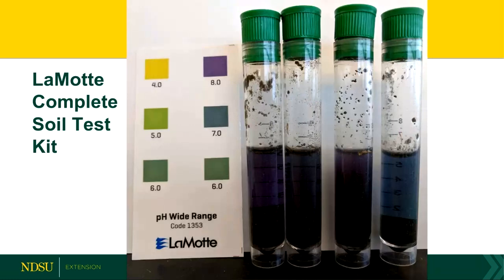Another test I did is the Lamott Complete Soil Test Kit. This one has a few more steps — it actually uses an extraction process like we would do at a soil testing lab, so I think it mimics the lab a little bit more. You add an extract solution, shake it up, let it sit for 10 minutes, then suck some of that liquid out, put it in another test tube, add another chemical, shake it up, let it sit for 10 more minutes, and then take your readings.